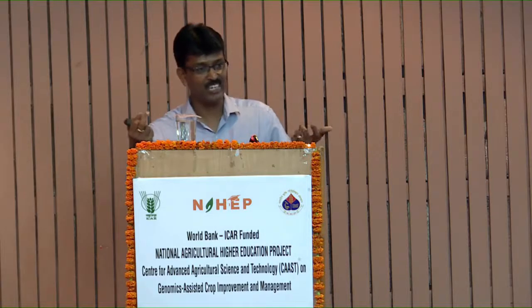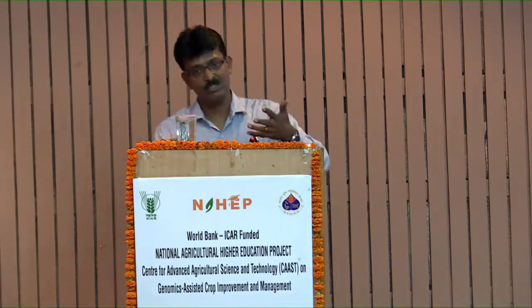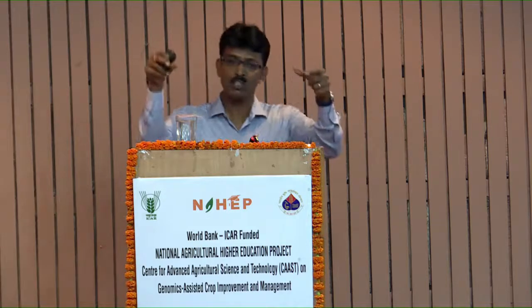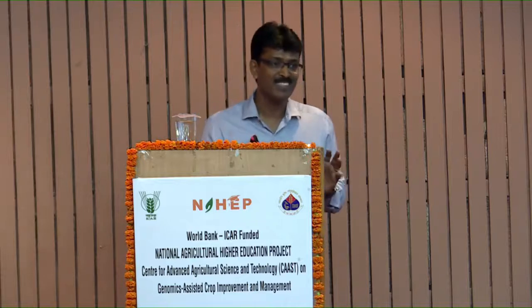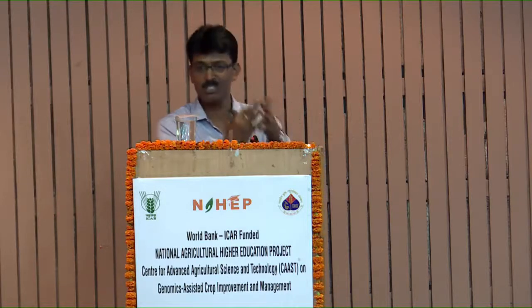What do you call a setup which has fluorescence and also quenching activity? So some company will help you. You have to provide the nucleotide sequence to them. So they synthesize the probes for you by adding the appropriate dye which you have to select, which I already told. It may be FAM, it may be TET, anything of your choice, and also the quenching. So the quenching chemicals may be TAMRA or BHQ. Just now I told any one of them. They will add these two, and they will supply the probe to you. It is much like ordering the primer. You order a primer, after a couple of weeks, the primer comes. Something very similar to that. There is no big difference.